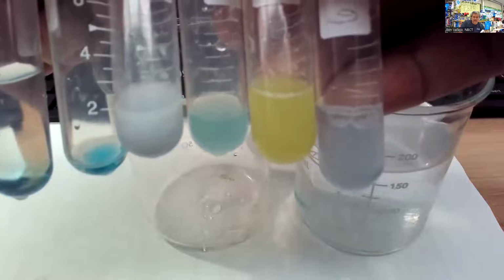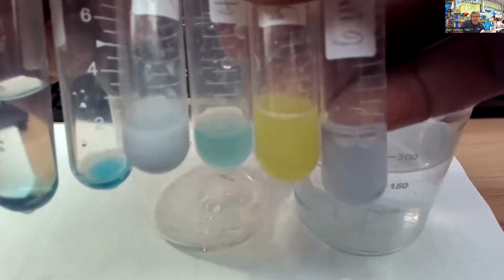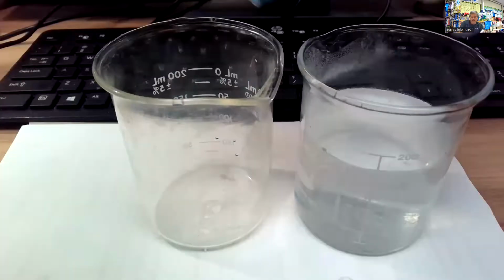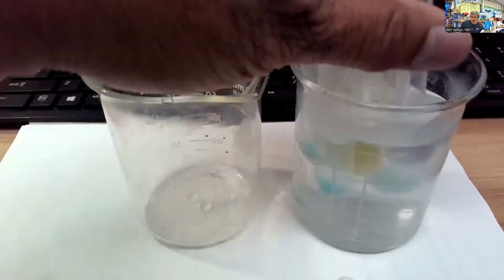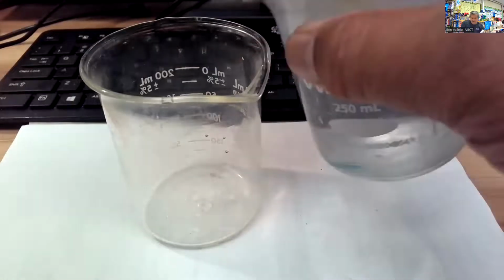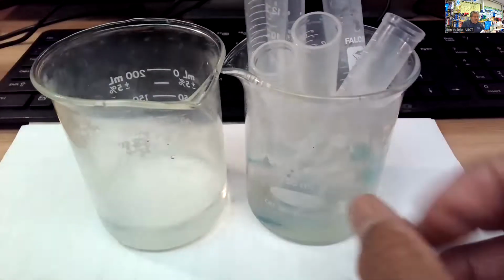Okay, and let's go ahead and put them in the hot water bath all at the same time. It only takes about 3 minutes to do. So let's go. Ready, set, go. That's going to pour off some of the water so these don't float. There we go. These guys are sitting right here.